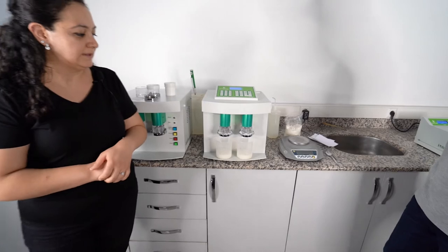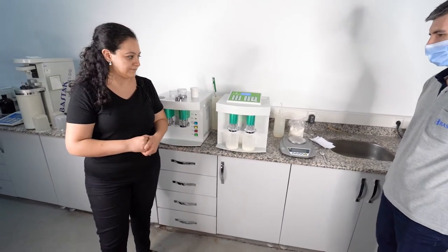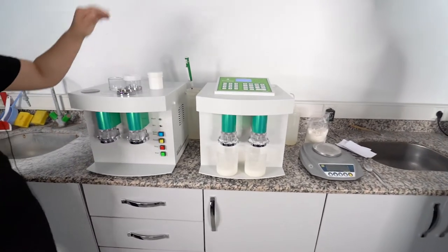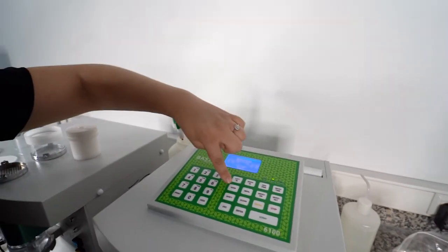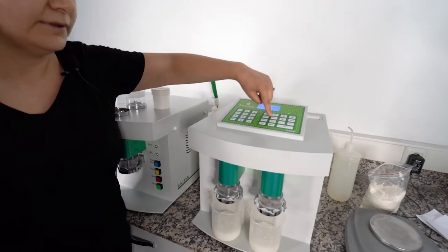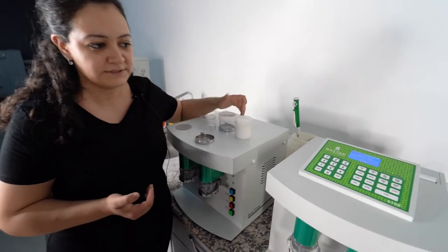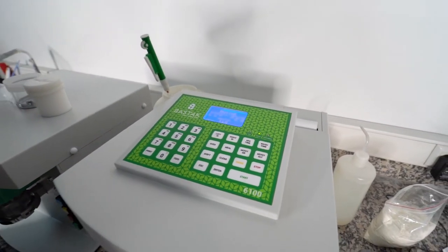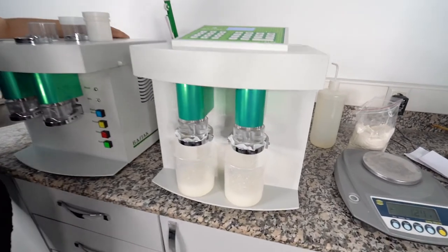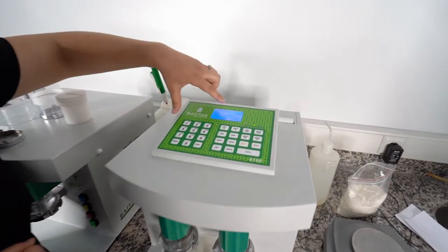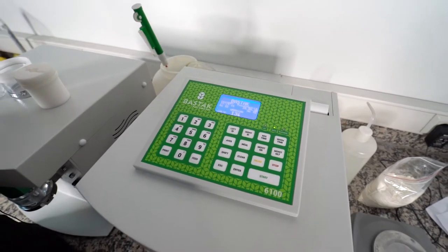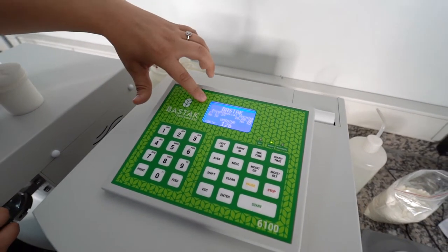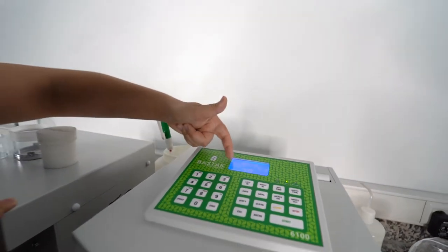You can help the collection of samples. You can take average of the samples at the end of the test. There is an average button here and you can do the test for meal samples. If you forget to make the test according to the moisture at the first time, then you can calculate from here: moisture GLT. It's calculating the result and calculating now.